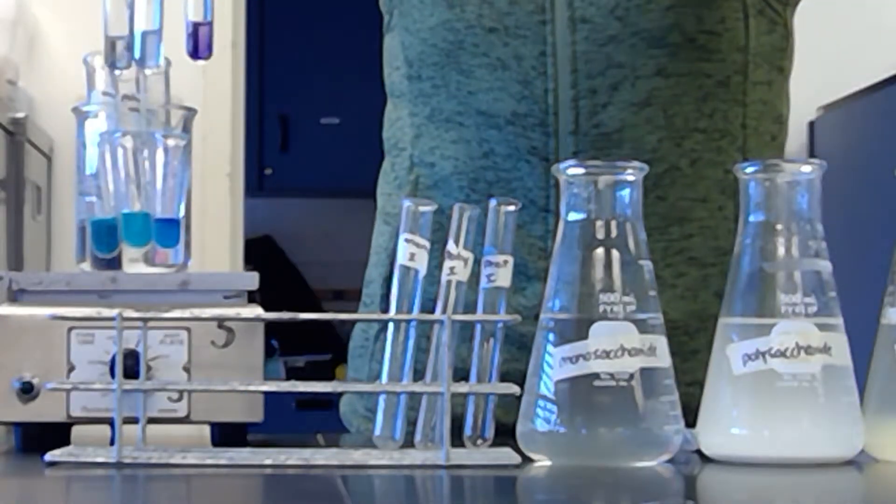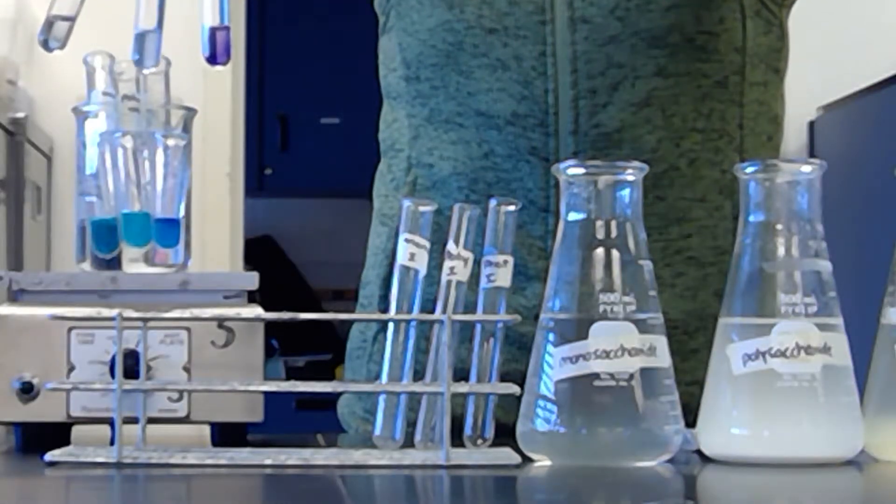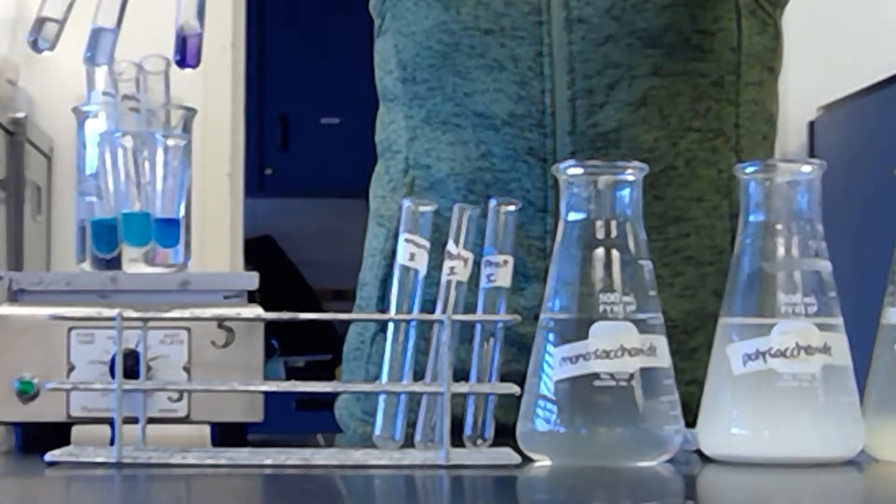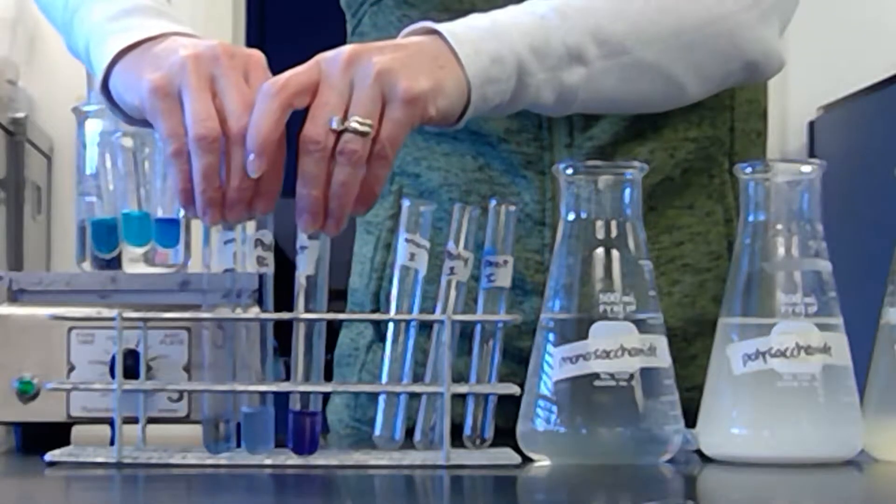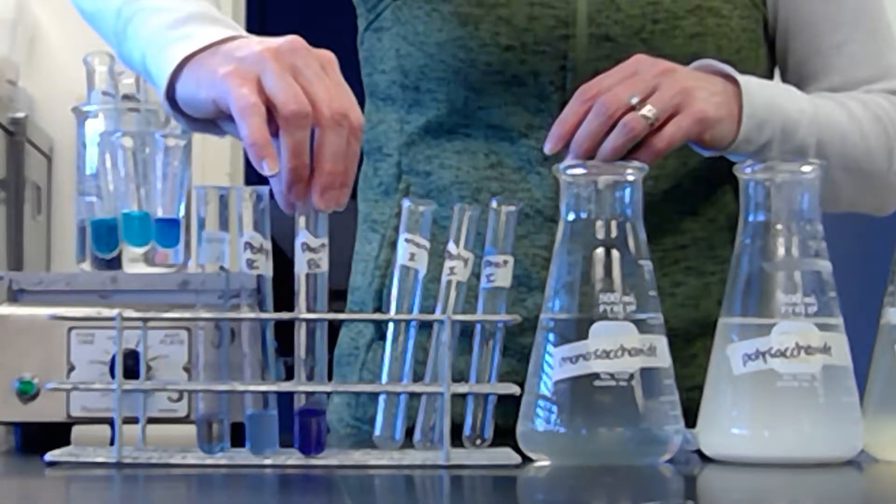So I don't know if you can tell, but the protein, so this third one came up positive. If you look at these, the monosaccharide didn't do much, the polysaccharide didn't do much, but then this turned into a darker purple, so this one would be positive.